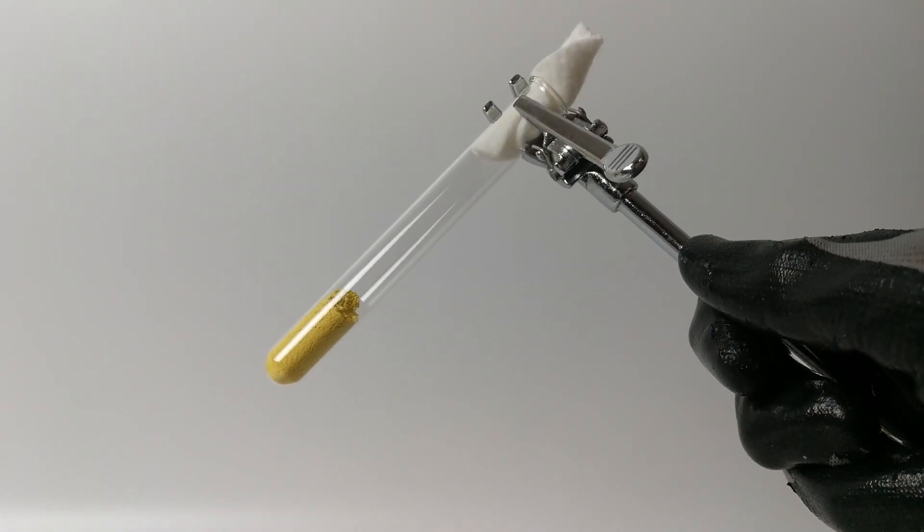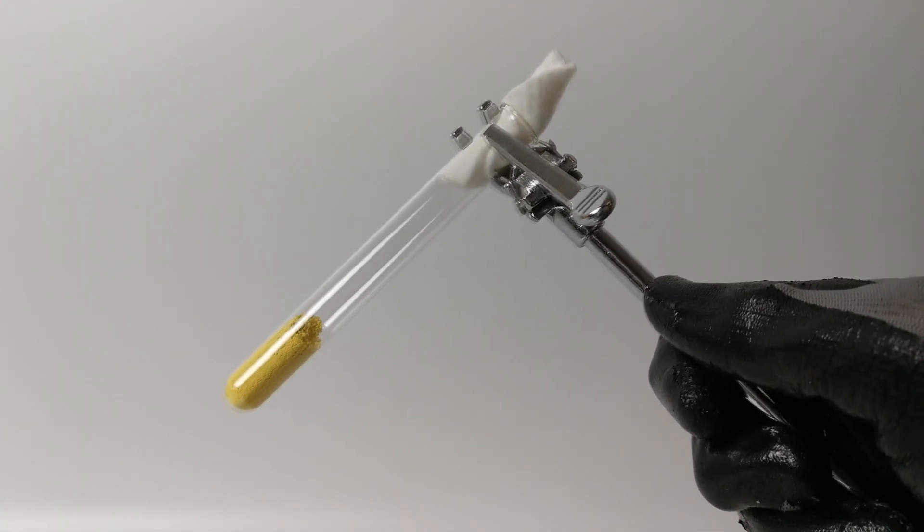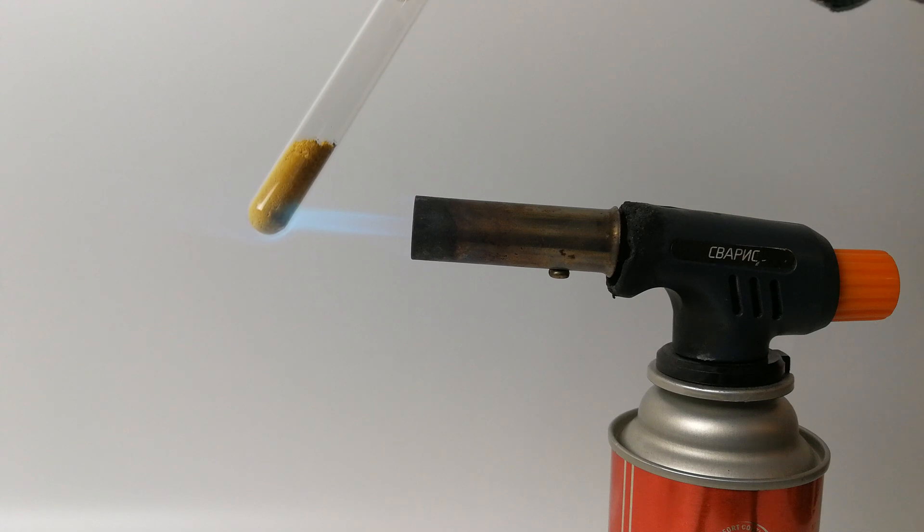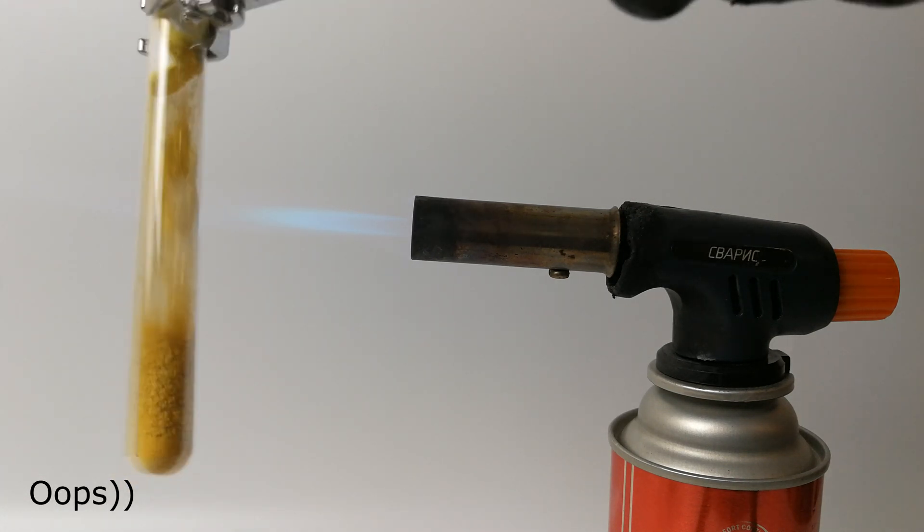Let's put a small amount of our oxalate into a test tube and plug it with a bit of cotton. Now, we can light our butane torch and start heating the test tube. The gas produced almost pushed our ferrous oxalate outside the test tube, so it was quite a good idea to plug it.